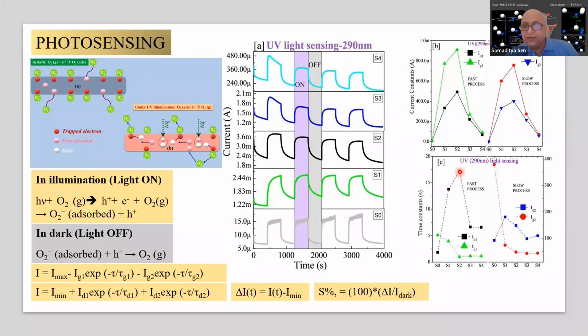Okay, 17.5 with doping, right? And then it became faster again. And it has to do a lot with the electronic structures. This can be correlated with the lattice strain and other things. Those are all internal things that we have to assess. To write a paper, to do analysis, we have to see what is determining what.